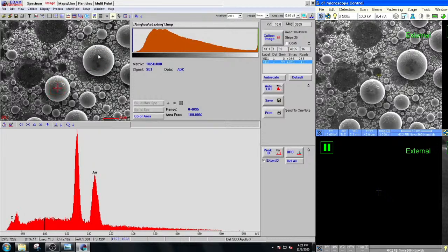If you go to point mode, you can then park the beam on one pixel in the image. This would be equivalent to just zooming in with the SEM, the advantage being that you can get a lot of spots covered without having to move around a lot. The other function is like a polygon mode. This lets you draw a strange shape on the screen, and then it'll scan the beam inside that area, and so on.